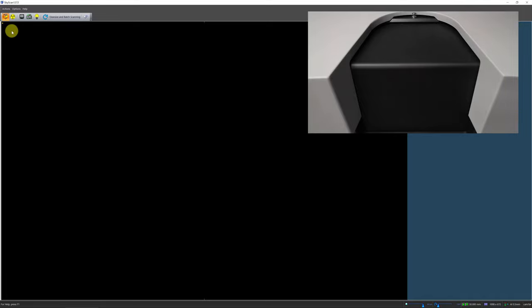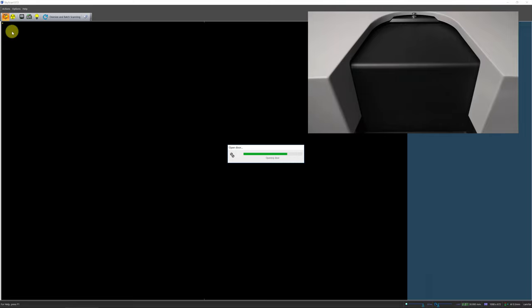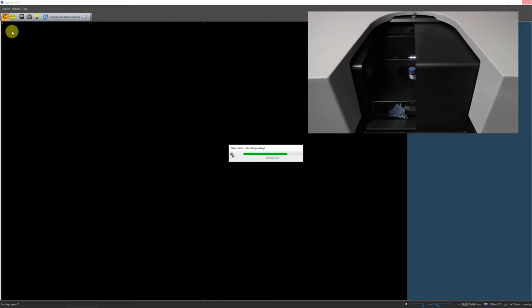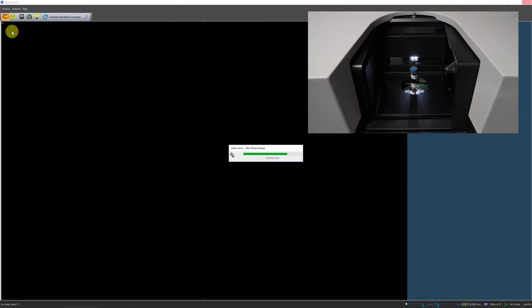Once you have prepared your sample for imaging, on the control software, first make sure the x-ray source is switched off. Then click the open/close sample chamber icon. A progress dialog will appear on the screen. At the same time, the chamber door will slide open. A protection plate will be lowered onto the top of the circuit board, and the object manipulating stage will rise to its zero elevation position.